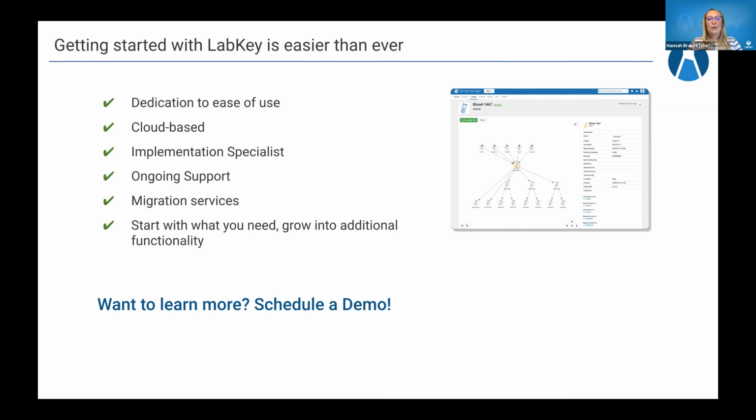database backups for you. You're provided an implementation specialist when you sign on with the Sample Manager, as well as being provided that ongoing support as a service that we provide. We also do provide migration services, although not many people need this. Overall, the application has been so easy to use that folks really choose to do their own migrations because the bulk process is quite simple.